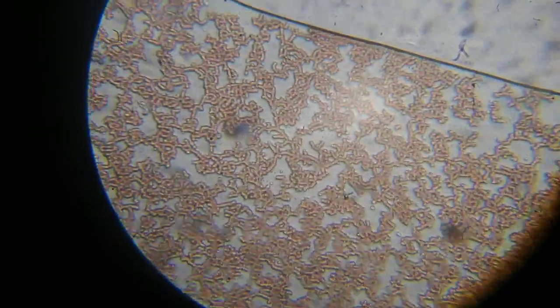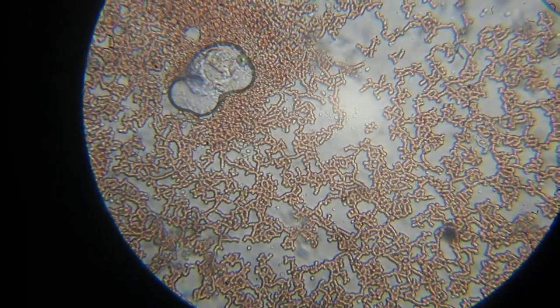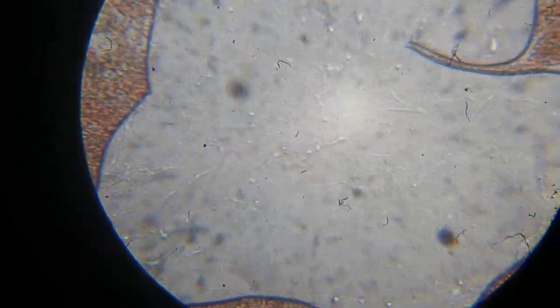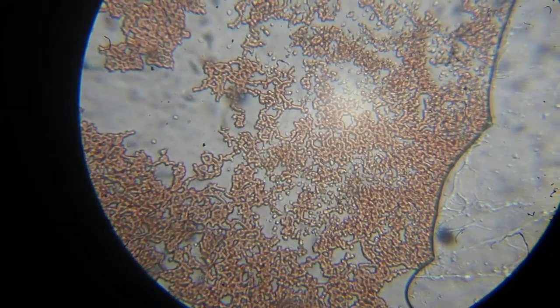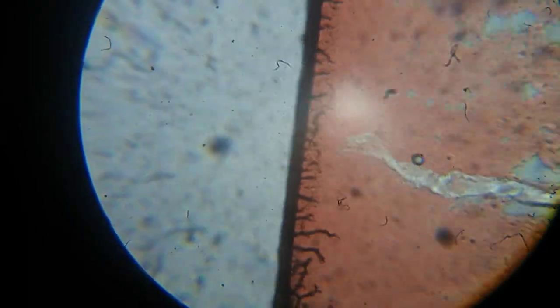You see this, that's an arrow over there. As you will see in just 1 minute, I know I'm creating false tension, sorry, but it's my habit. We will see red blood cells, but I guess they're not really red blood cells, but you decide. You will be the judge of that. This is still with the blue color. I know it looks red, but it's actually blue color. And now for the red color.